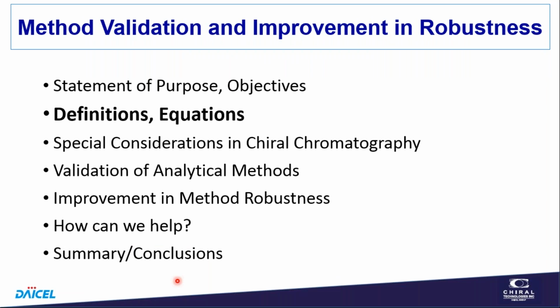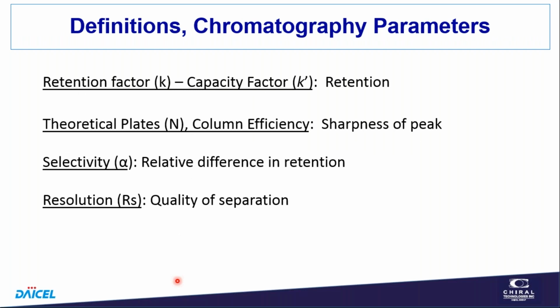Okay, I have a few equations to show. The things I like about using equations is that they are a succinct expression of the relationship between the parameters and some effect like resolution or retention or something like that. These are fairly simple equations, no quantum mechanics, no matrices, no imaginary axes. And these are all equations and parameters that you're probably familiar with from achiral chromatography.